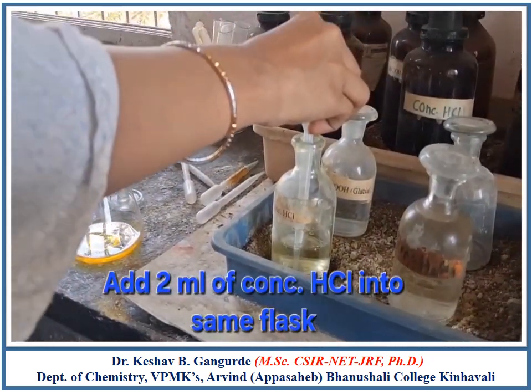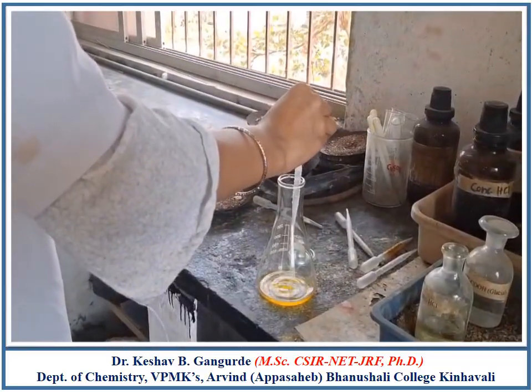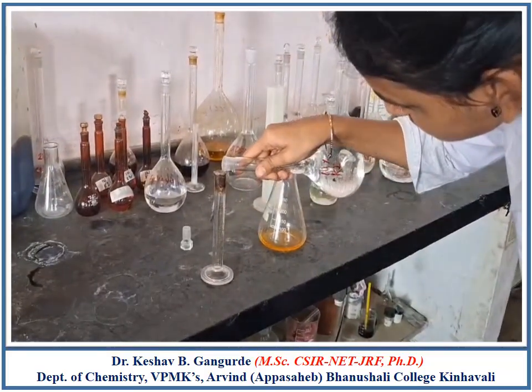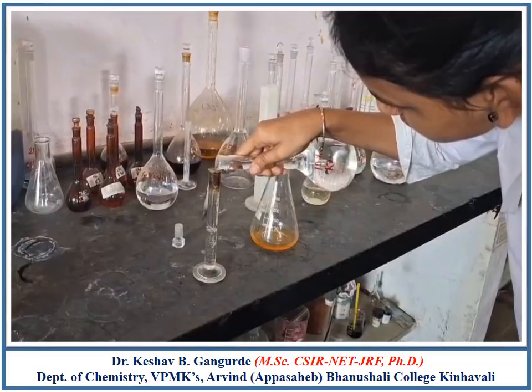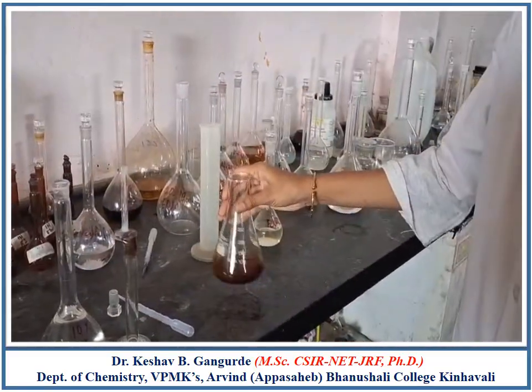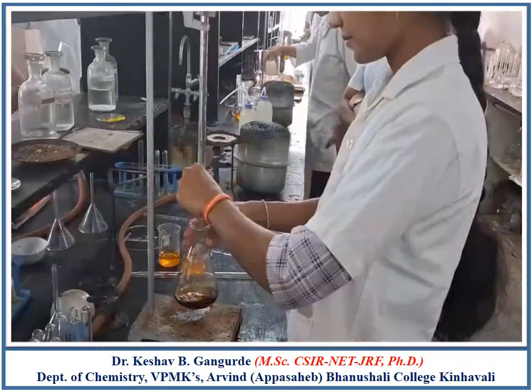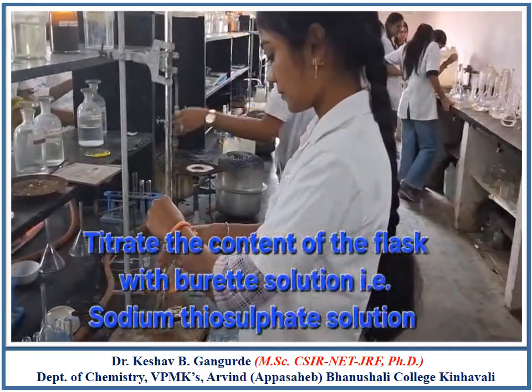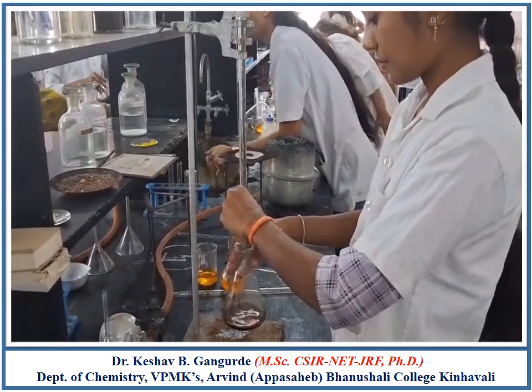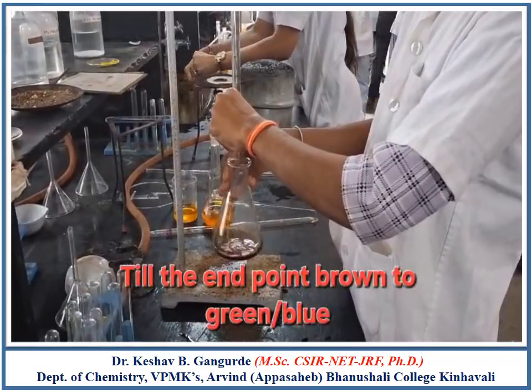To the same solution, add 2 ml of concentrated HCl. Measure 10 ml of 10% KI and add it also in the same flask. Shake the flask. Add 2 drops of starch indicator. Titrate the content of the flask with burette solution, that is with 0.1 normal sodium thiosulphate solution, till the end point brown to green or brown to blue.